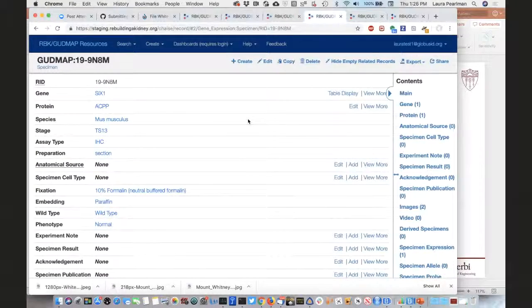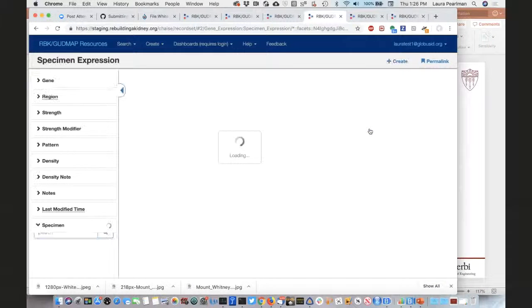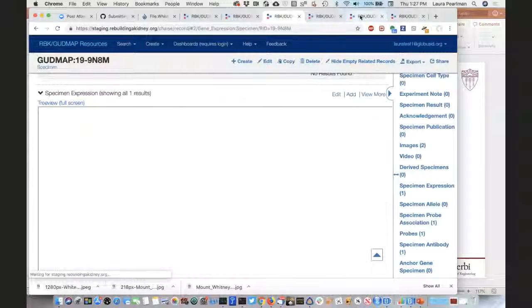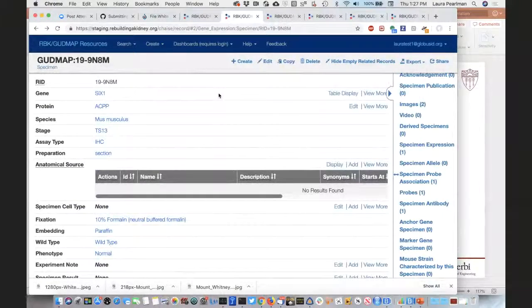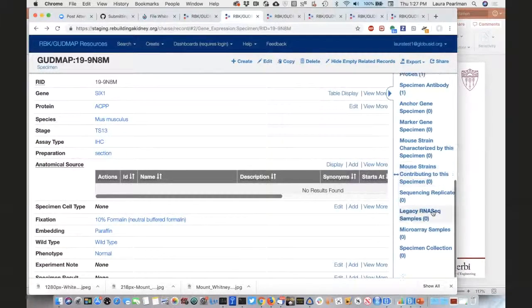We have a couple of views of this, so you can see this either as a table or as this nice tree view. But I have somewhat foolishly added something that's not valid for the age that we have, so the tree view doesn't particularly like that. So I'm going to show you something that actually looks good.